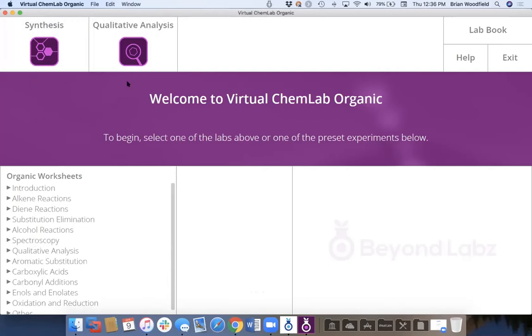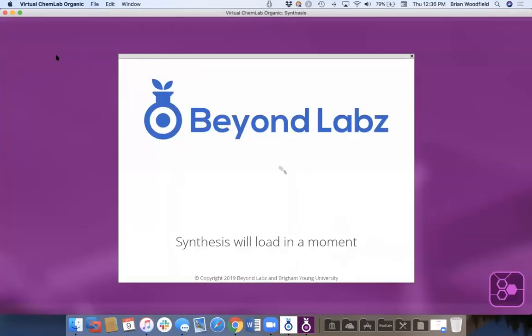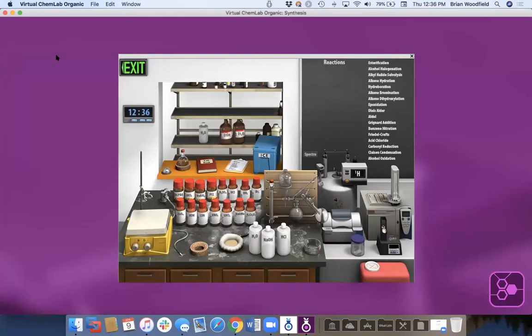So I know you want to get to qual, but I think doing synthesis first makes more sense about what qual does and why we do it a little bit. So I'll just do this quickly.